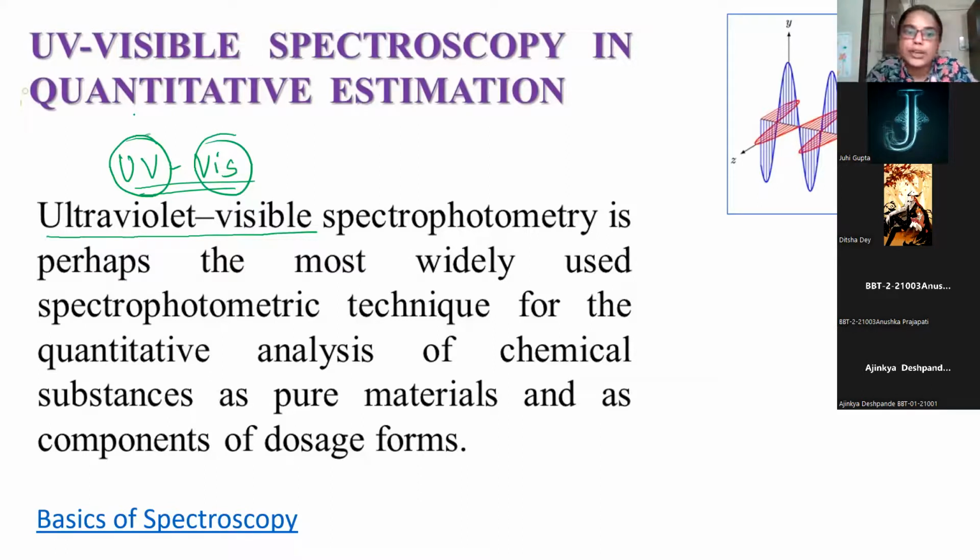You all have used the laminar airflow. Everybody, I'm sure, must have seen the laminar airflow. In the laminar airflow, you see that long tube, which is bluish in color, which is a UV tube. All of you have noted it? Yes. Similarly, in the spectrophotometer also, there is a bulb, a source of light, which is also of similar color. That is your UV source. And the visible source is a different source, which is a non-UV source.